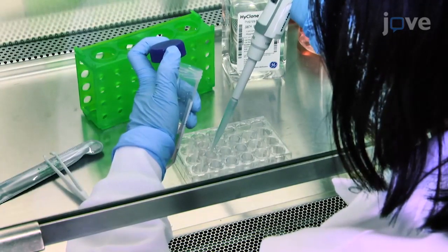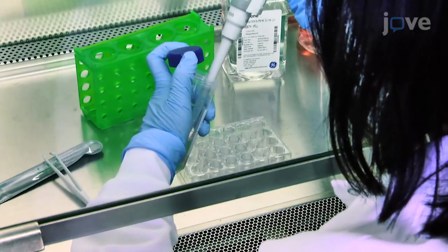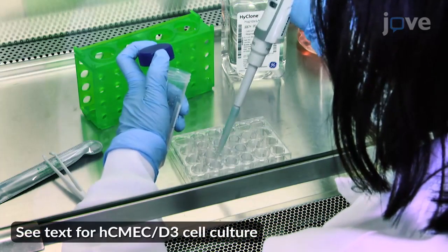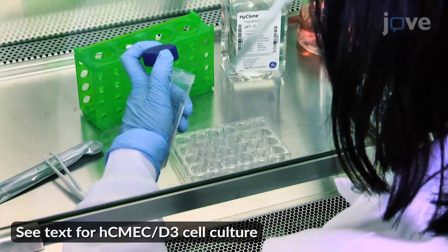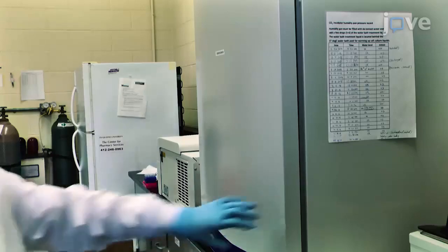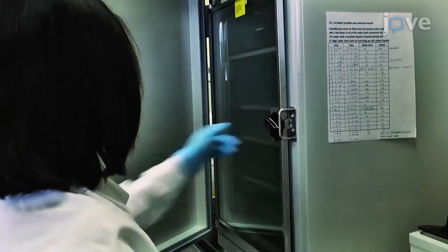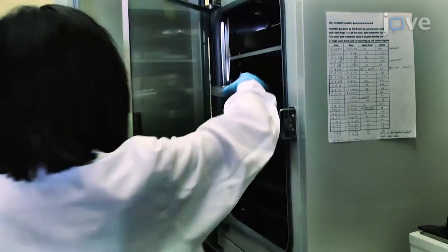Now, plate HCMEC D3 cells with a density of 50,000 cells per square centimeter in the cell inserts. Place the 24-well plate with tissue culture setup in the incubator to allow cell attachment and proliferation.